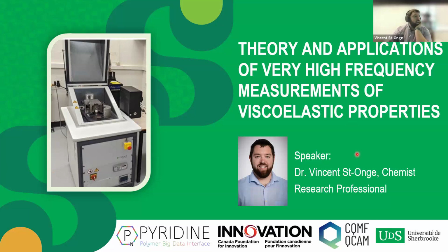So as mentioned, today I will be presenting a bit on the theory and applications of very high frequency measurements of viscoelastic properties using the Metravib VHF 104 instrument, which is the one you see in the picture here. We were lucky enough here at University of Sherbrooke to receive a large grant from the Canada Foundation for Innovation for the Polymer Big Data Interface project, which allowed us to purchase the instrument.